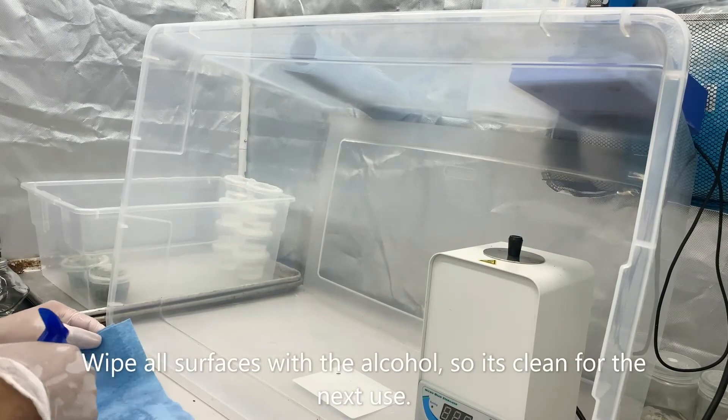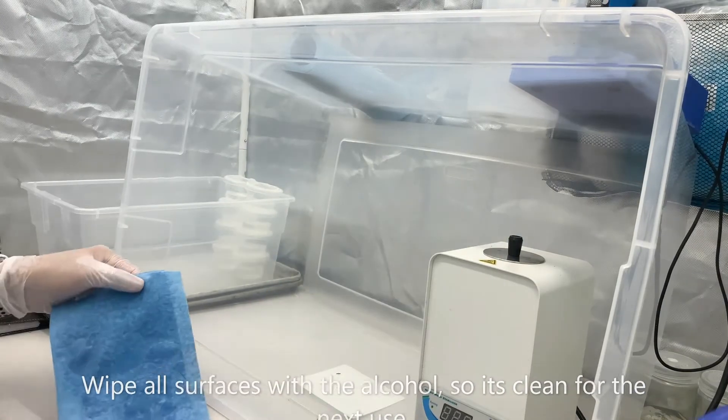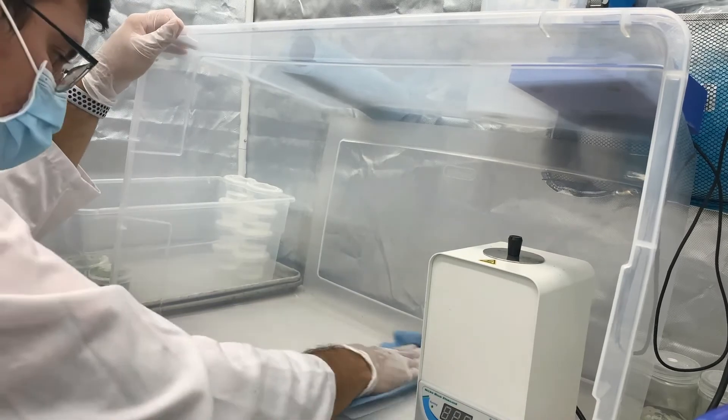To ensure you don't have any leftover contaminants, just remember to wipe down your area so it's all nice and sterile for the next time.